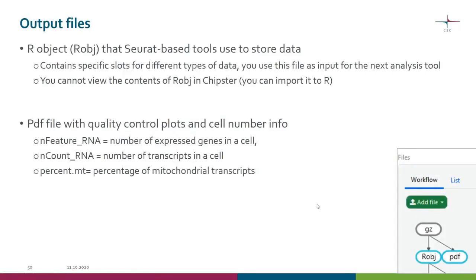When you run the tool, you get two output files: one is the R object and the other is a PDF file. The R object is a special data structure — a Seurat object — that Seurat-based tools use for storing different kinds of data, with specific slots for different data types. In Chipster you use this file as input for the next analysis tool. You cannot view this file directly in Chipster, but you can import it in R. The interesting file at this point is the PDF file containing the quality control plots.